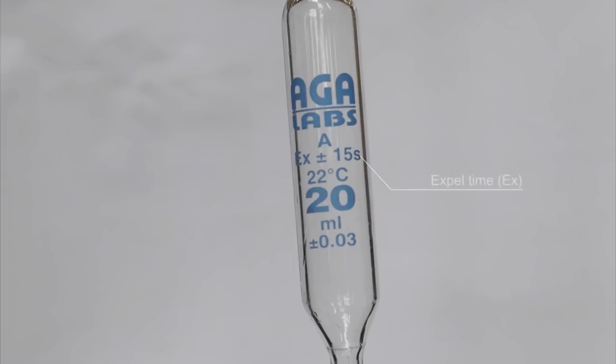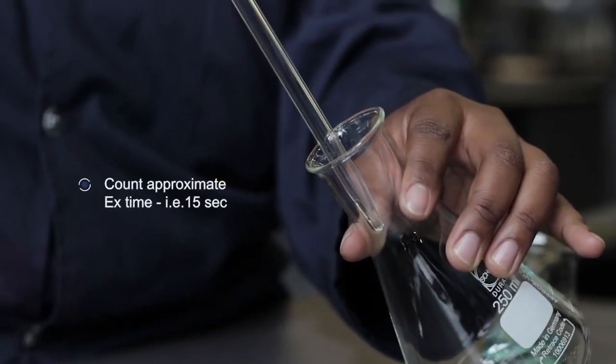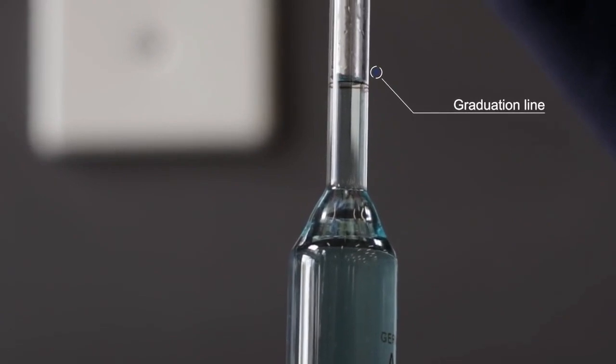This value indicates the expel time. Once all the solution has been expelled, you will need to continue to expel for approximately this period of time to ensure that you have delivered all of the liquid. A single graduated ring indicates the calibrated volume, for example, 20.00 milliliters.